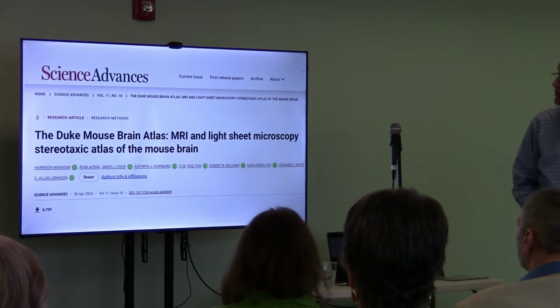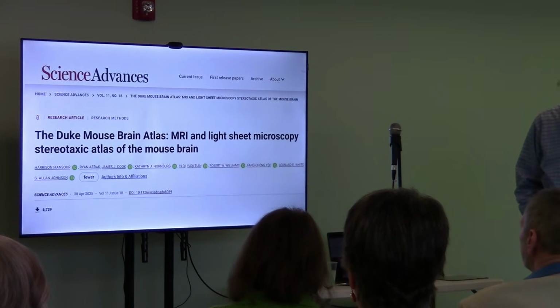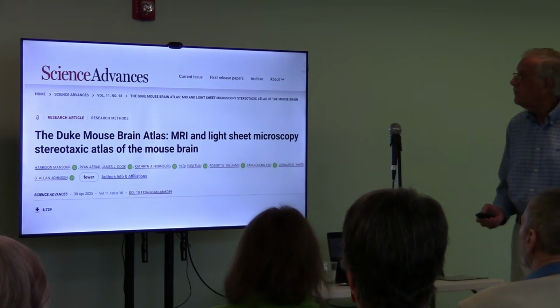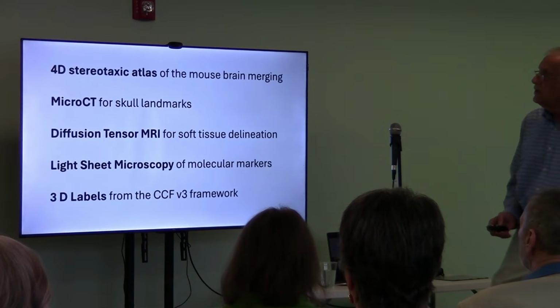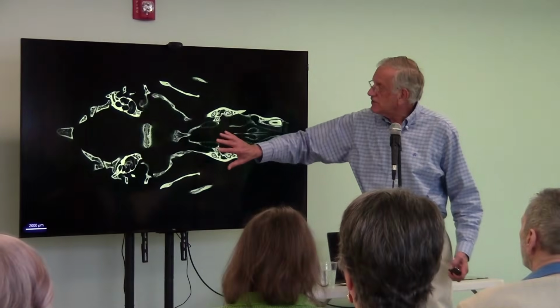This was published 2 years ago, and this is, I think, so this is our atlas. It was assembled as a stereotactic atlas.